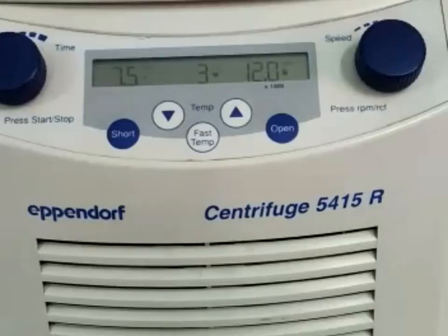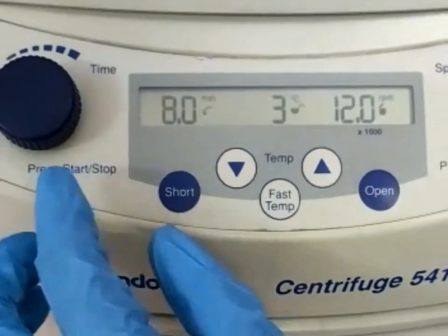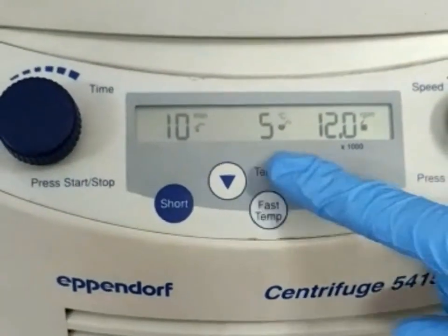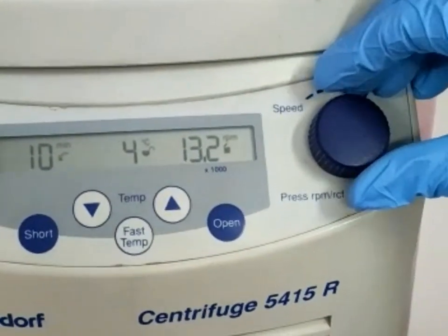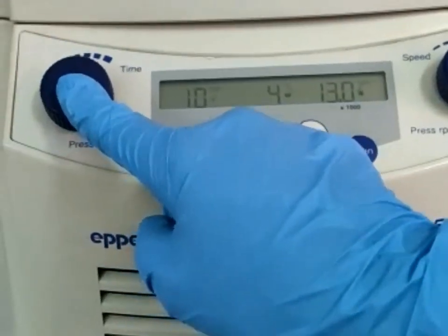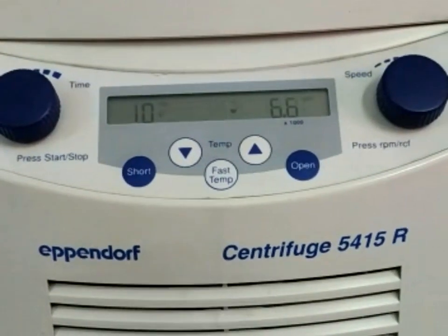Now we can set the time, speed, and temperature. The time is set with the help of the time knob — I will set it to 10 minutes. With the help of the arrow keys, we can set the temperature; I will set it to 4 degrees Celsius. With the speed knob, we can set the required speed; I will set it to 13,000 RPM. Now we press the start button, and we can see it is centrifuging our samples according to the data we have set.